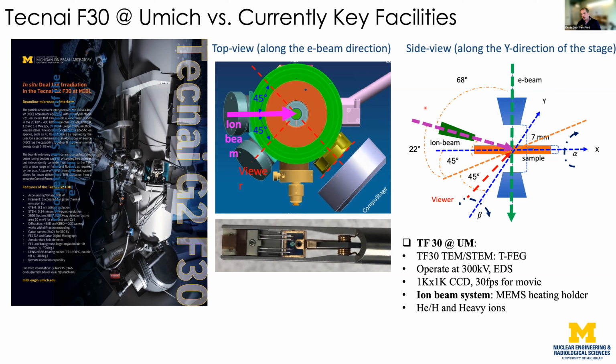And you can imagine the huge advantage of doing your observations in situ, because you can look at the same region of interest and see those defects grow and move, and you can tie that in quite nicely to modeling techniques. And so we wanted to have that facility, and so we developed it through a survey. I think there are over 10, less than 30 in-situ irradiation facilities across the world. We did a survey and realized that we could do it.